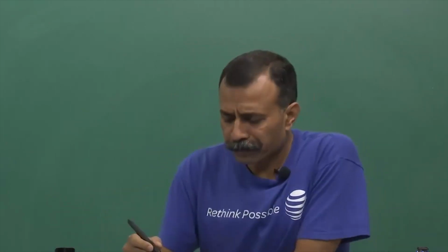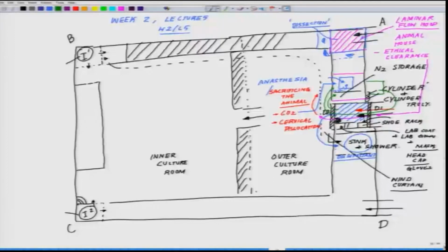Okay. So, coming back, you have to have an animal sacrificing facility, and you take the tissue out, whatever concerned tissue, and now you have to do everything in the hood. When you get into the hood with the tissue, you have to have a buffer system, which we will come to in the medium development. It will be helpful to ensure that the tissue remains alive during your dissection.